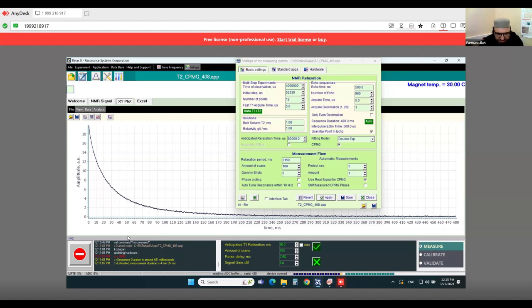So you see that the result is getting better and better from the last time, in which I used 20 scans. And you will also see the difference of these. Okay, so it's completed. You can also reduce it.